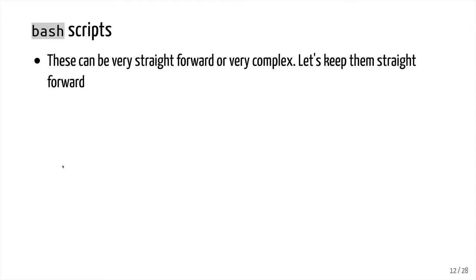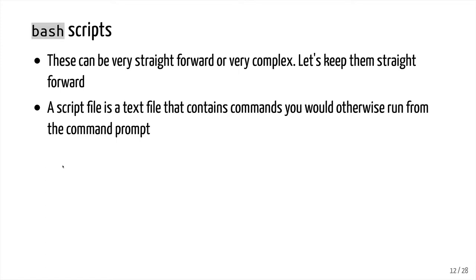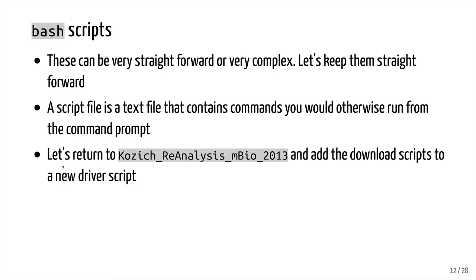Bash scripts can be very straightforward or very complicated — we want to keep them fairly straightforward. A script file is a text file that contains commands you would otherwise run from the command prompt. It's nothing magical. We're going to return now to the Kozich tree analysis and add the download scripts to a new driver script. As we do this, we're going to be sure to add comments. Of course, we're also going to be using the Amazon EC2 instances we've been working with on previous steps of this project.